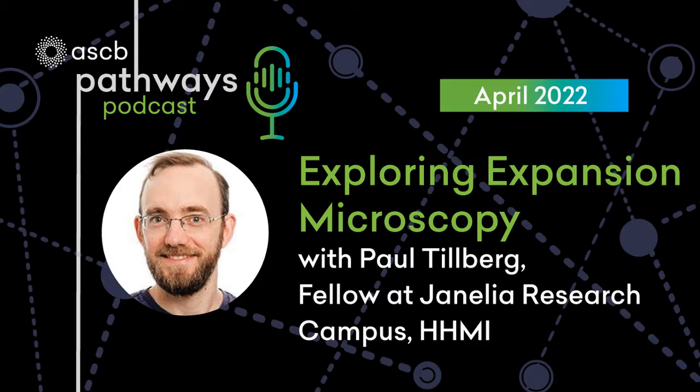Now, it's not quite as bad as it sounds because the background also comes down dramatically. So your signal to noise ratio ends up being boosted. But when the signal is so low, that means that the signal level is a limiting factor. So you need to have a high quality antibody, and you might need amplification. And sometimes those amplification techniques might not be so cheap.